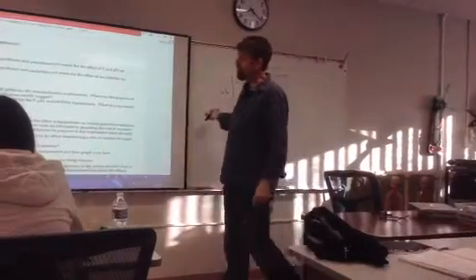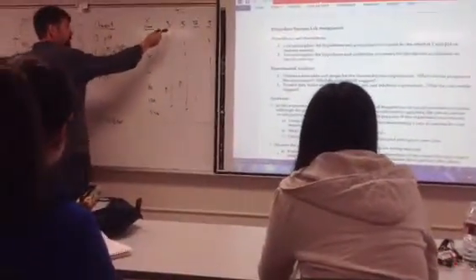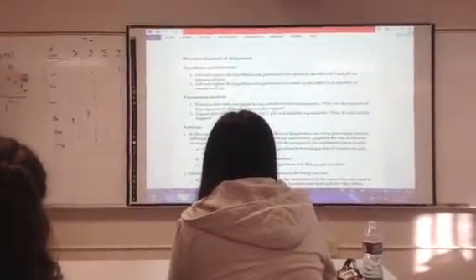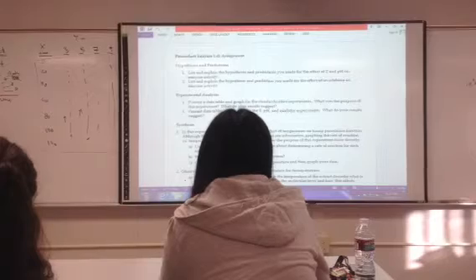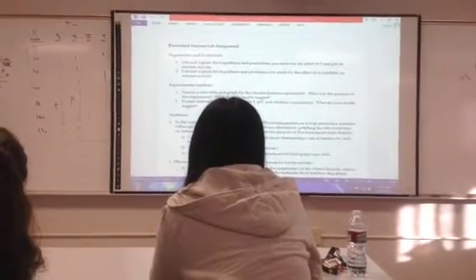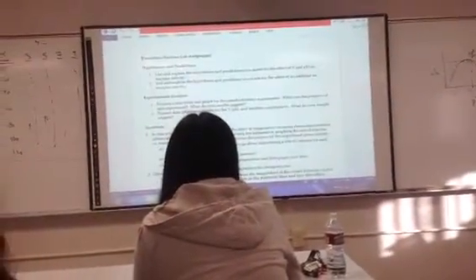And then you would repeat the same thing, or you did, hopefully, repeat the same thing with temperature. What's different here is not 3, 5, 7, and 9, but 4 degrees, 20 degrees, 32, 48, 99, whatever you did. And you're going to, again, produce the graph that looks like this. You need to calculate the rates. And you need to produce that kind of graph that shows the effect of temperature on that.